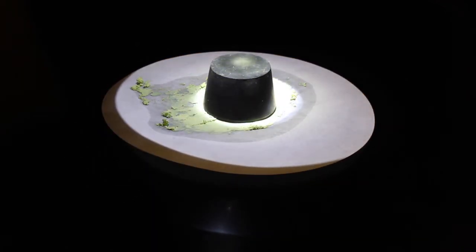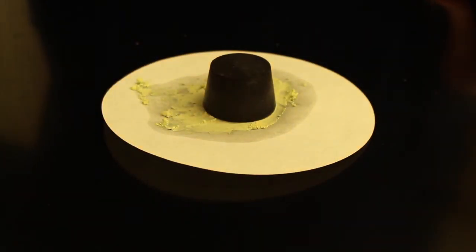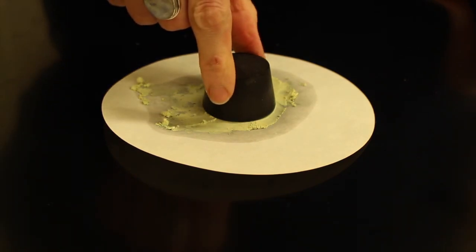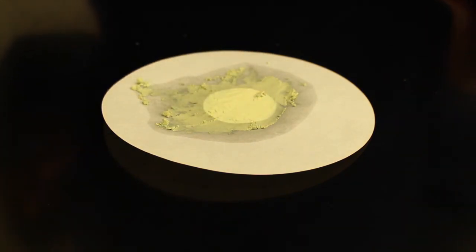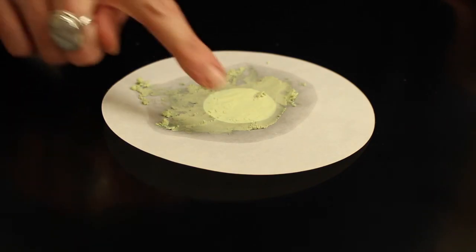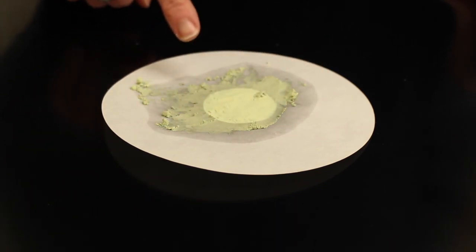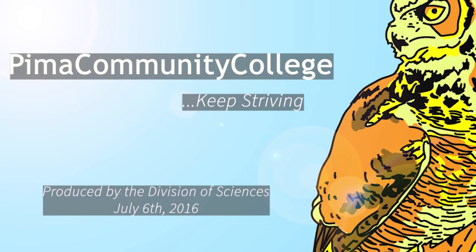As we remove the light source and we now remove the stopper that was blocking the silver bromide, we can see that there's a silver color due to the exposure of the silver bromide to light and the original silver bromide still remains, retains its original yellow color.